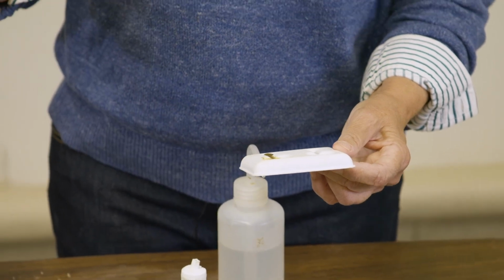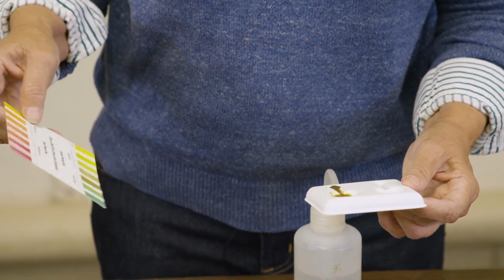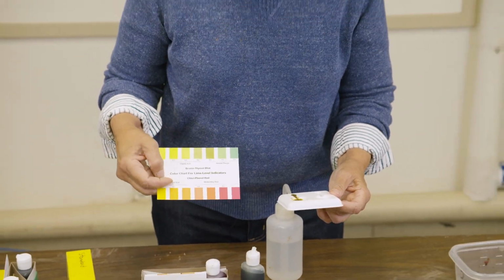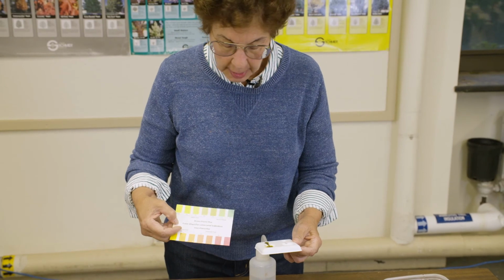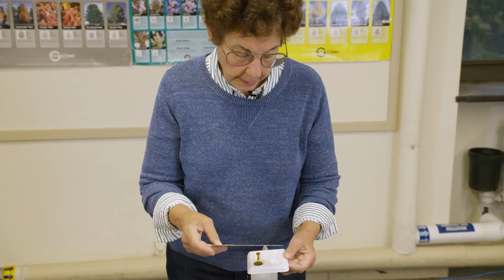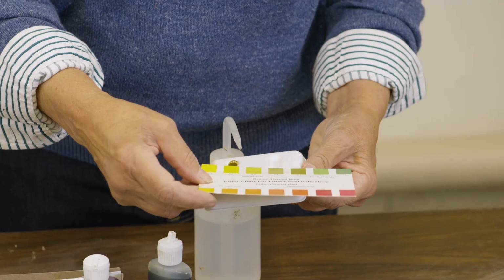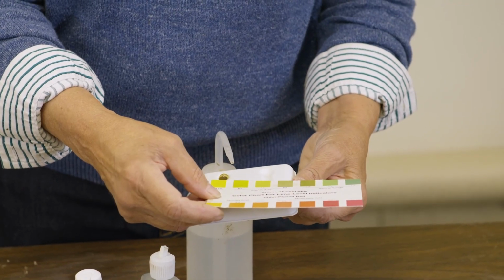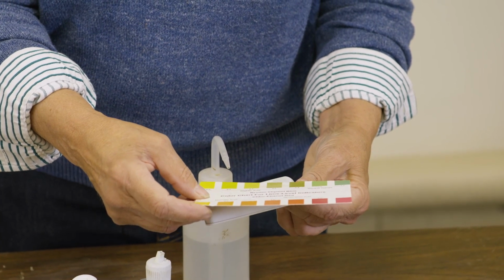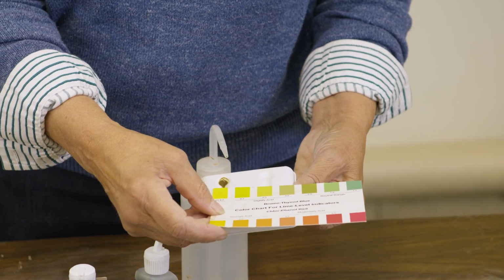So we use a color chart to determine what the pH is reading. And in this chart it says bromthymol blue on the top. So we're going to look at the color we find in the channel versus the color chart. I'd say somewhere between 6.0 and 6.2 based on the color of the chart, maybe 6.0.